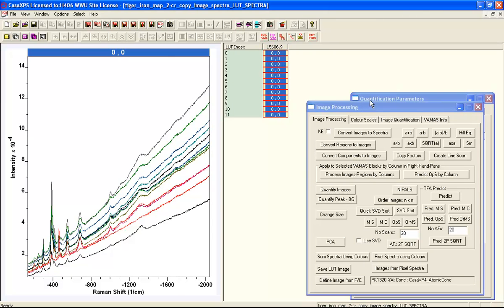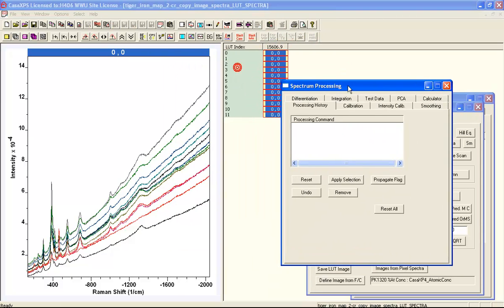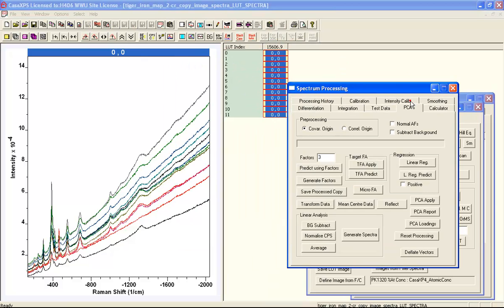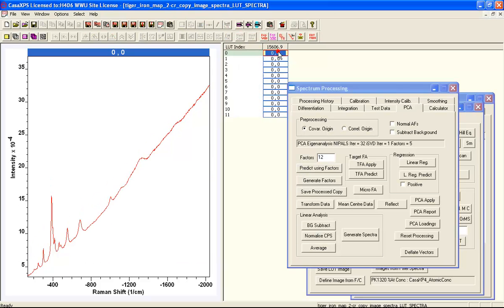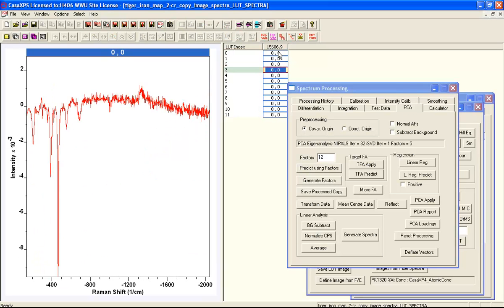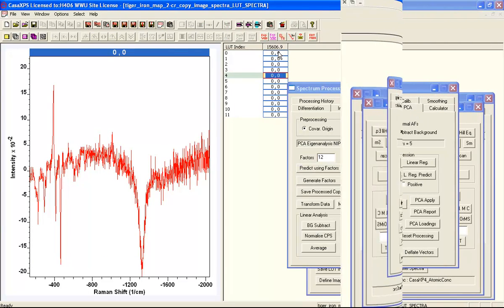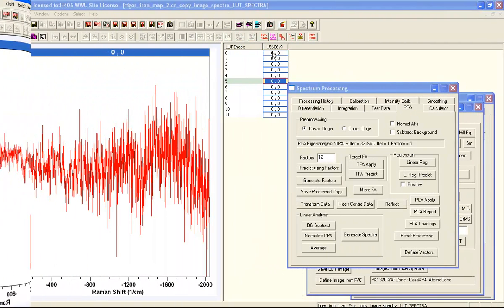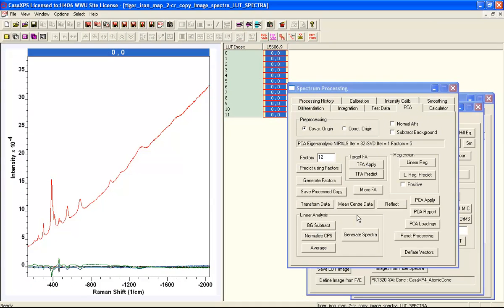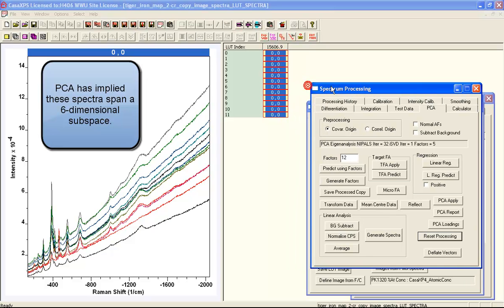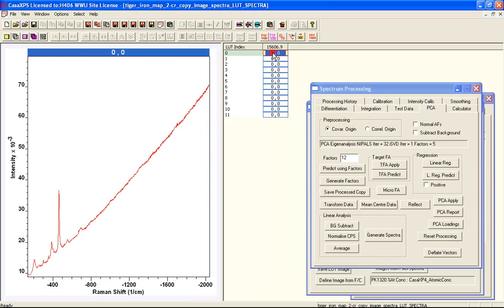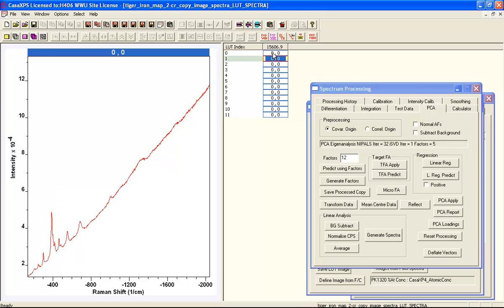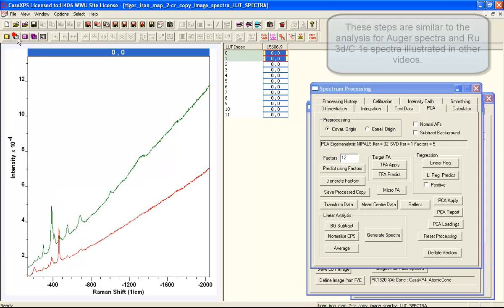If you do a PCA on these 12, you can get an idea of how many fundamental shapes are within the data set. You can see that there are spectral features from these 12 spectra that are probably up to about 5 or 6 abstract factors where there might be spectral features. We're going to look for 6 different vectors that we can use to reconstruct the entire data set on the basis that the PCA suggested that there were up to 6 different shapes within these data.